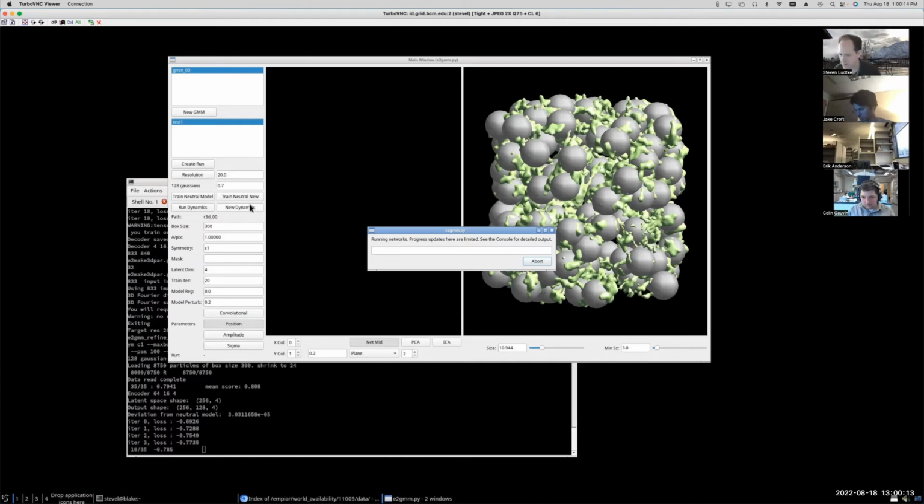All right, that should keep him busy for at least a minute or two. All right. It's going.